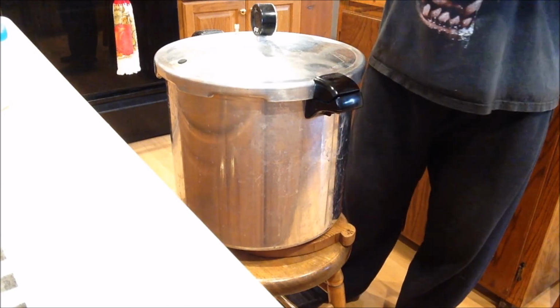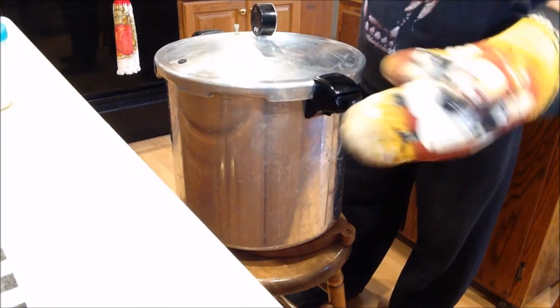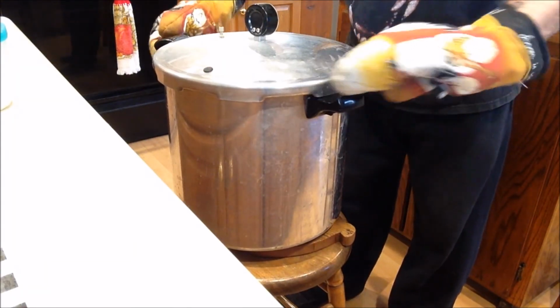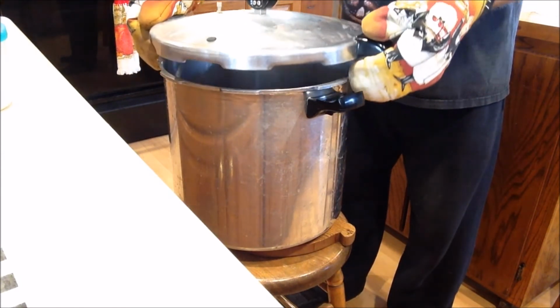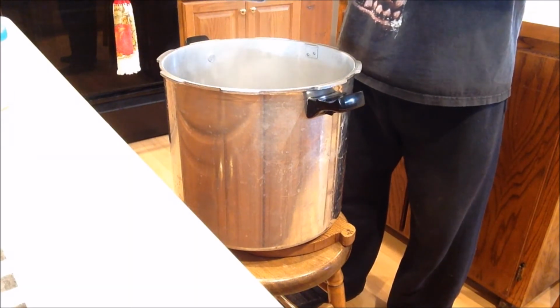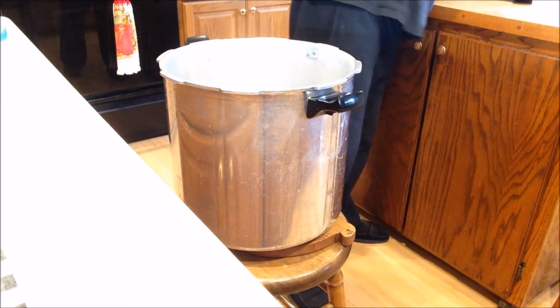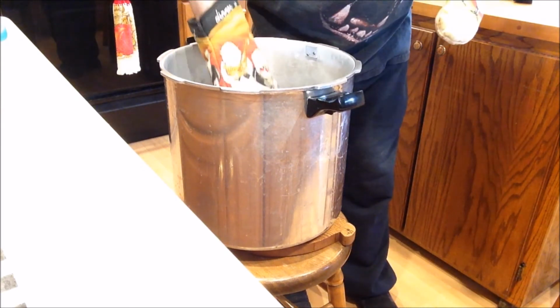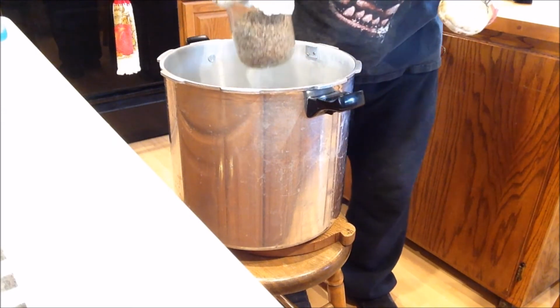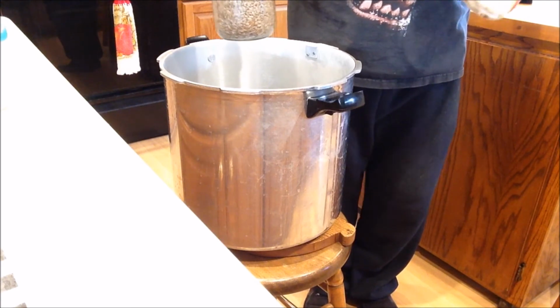Let's see what we got here. I always wear oven mitts. It's very, very hot. And always be careful of steam, too. Okay. Put that off to the side. We'll get it out. Bring it over here.